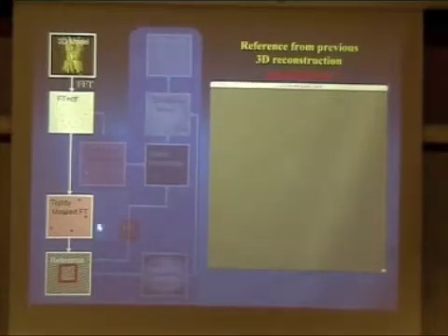This way, you can create your Fourier transform masking in the same way. All the spots will come out because it's perfect, and then you can create your reference area from that. So you have different ways of creating a reference area, either from your own image or from the overall 3D model. The program that does this is called the Matrix, and you will see it on a certain Friday in the particle session.